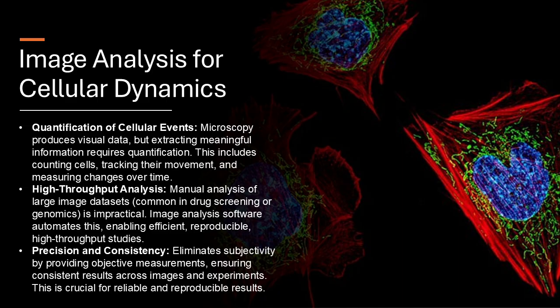But cells aren't just moving, right? They're also dividing, making copies of themselves. All the time. How do we analyze that? Cell division is another process we can look at. Think of it like a ballet with different steps. And the software can identify each stage. So we can train the software to recognize those visual cues.